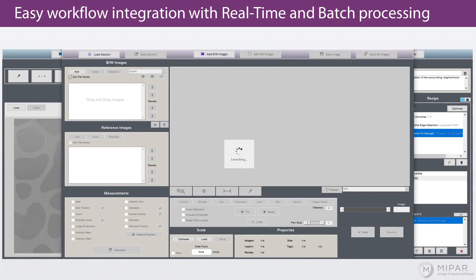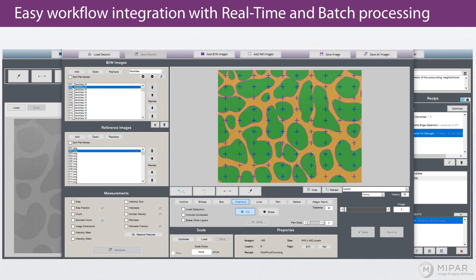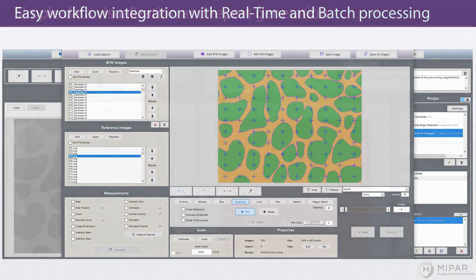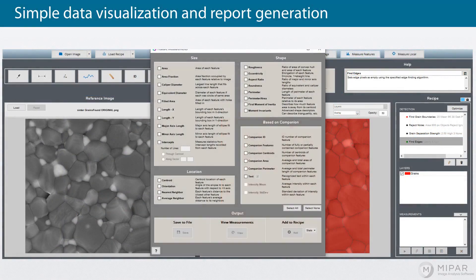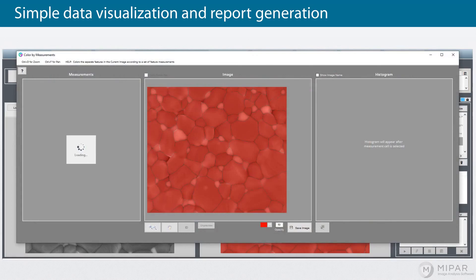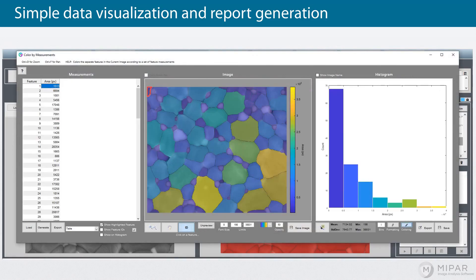And if necessary, MyPAR can even replicate traditional measurements such as point counting and line intercepts. Once you have your data in hand, you can use MyPAR's unique measurement visualization and our new report generator to share it with others.